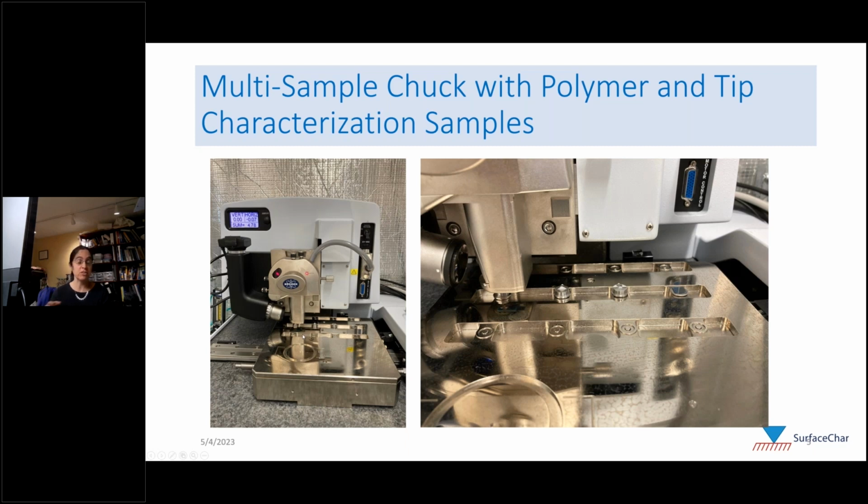And so this is just an image of the peak force data collection setup. The phase data was actually collected on a Multimode. The peak force we collected on an Icon, and you can see that here we had 3 ICPs set up at a time. Here was our tip check sample, and it was just automated, and it would run all day. We'd set up in the morning, and it would circulate through all the different samples and the tip check and collect our data.